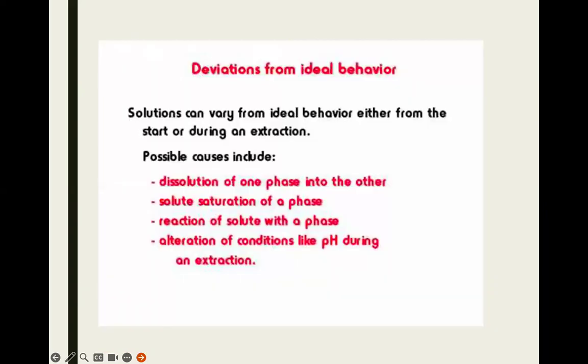There are some issues, of course, for ideal behavior. There are always issues. You have dissolution from one phase into another due to solvent issues. Sometimes the solute goes back to the aqueous phase from the organic phase, so it's not stable.